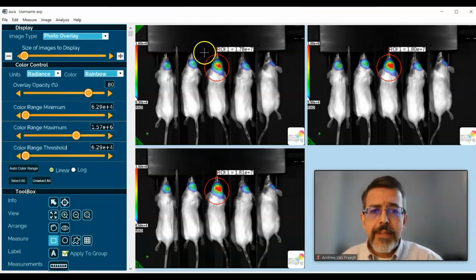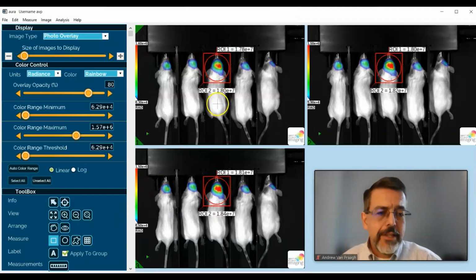And they're in the same lab and they're doing their images side by side. And so this is how investigator 2 would go ahead and draw their ROI. Now, is this really relevant? Is this going to affect the total photons per second value for that signal, the way it's investigated by investigator 1 versus investigator 2? Will we see a difference? Well, let's just take a quick look.